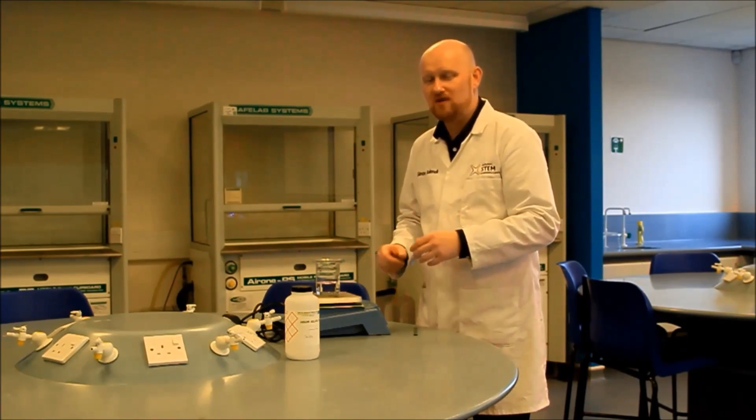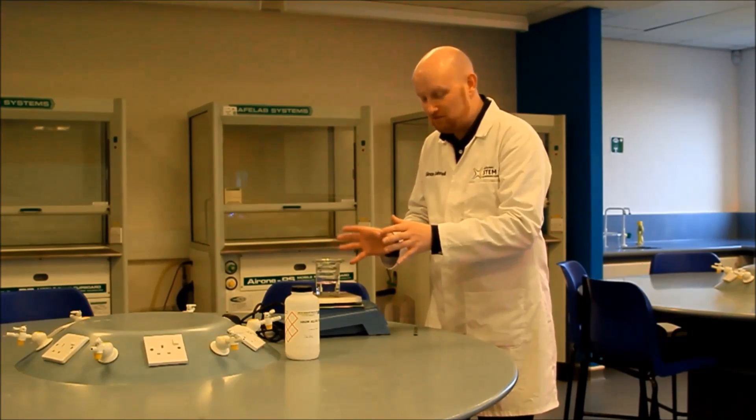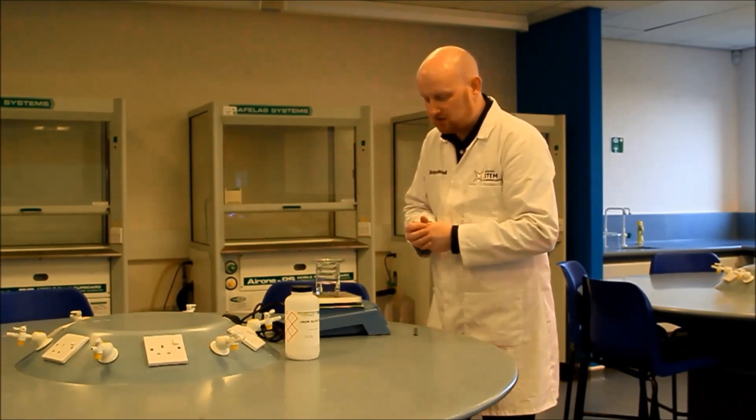If you shock this, if you knock this, if anything falls into it, it will crystallize and the demonstration will be ruined. So we've been taking lots of care with this, and that's why there's a watch glass on the top.